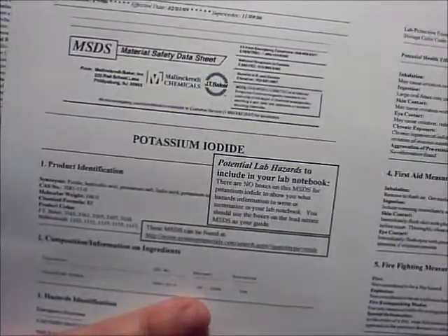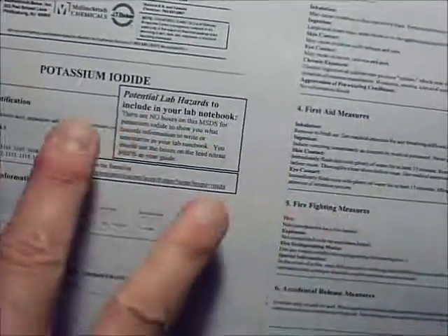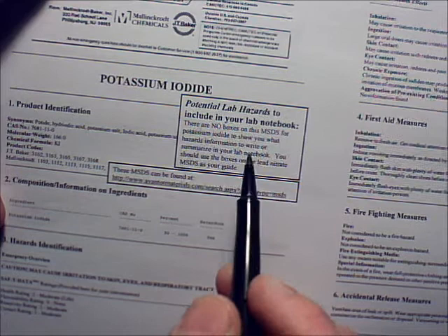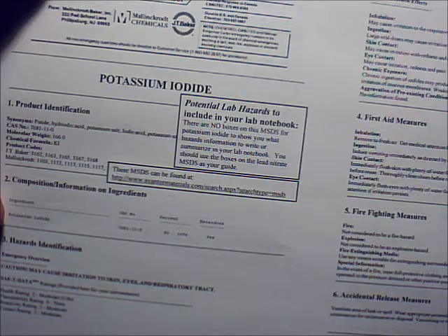Now, if you'll flip through this, you will see that there are actually two MSDS sheets in this little packet. There's another one for potassium iodide. And I don't give you all those specific arrows pointing out what you need to write down in there. I've written in this one box here that you have to figure it out for yourself using the previous MSDS sheet as your guide. Does that make sense?